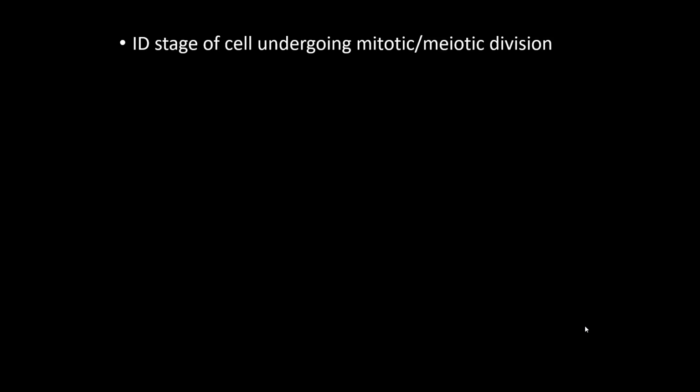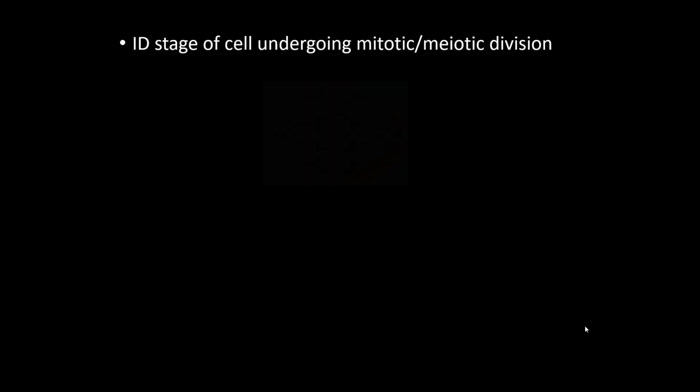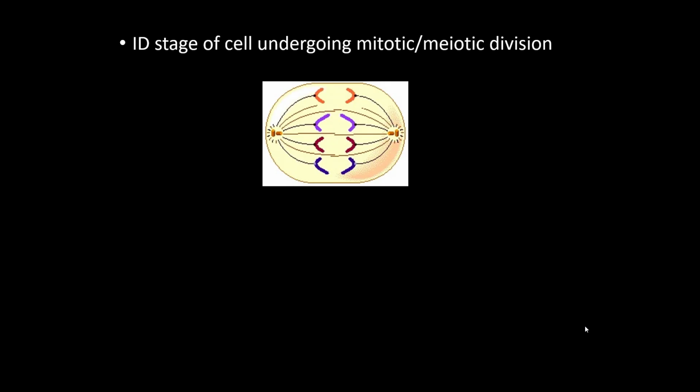All right, so let's look at some pictures and see what stage we're looking at, whether it's mitosis, meiosis, or if we're looking at things like prophase, metaphase, anaphase, or telophase. So we're going to look at each of these stages. In this first one, we see that the chromosomes are being pulled apart, and the number hasn't been halved, because most of the time in our pictures, we start with 4 chromosomes. We see here that this is going to be anaphase of mitosis.